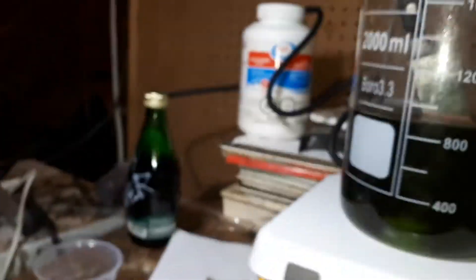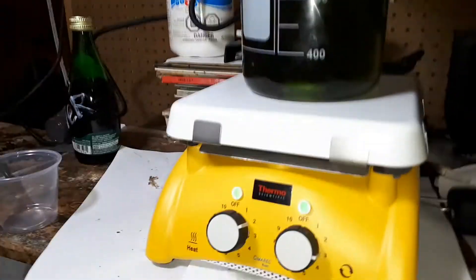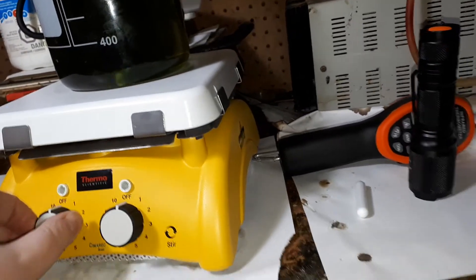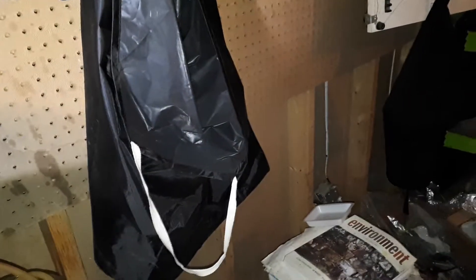I'm going to pull that out in about 2-3 minutes from now, or a couple minutes. Let's see — turn off the stirring. Take off this plate. Pull out the knife.